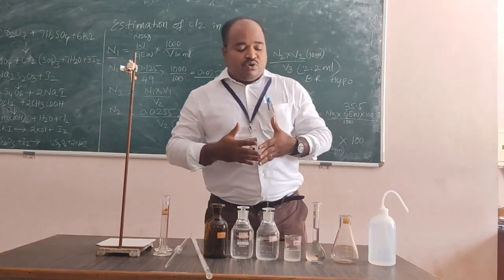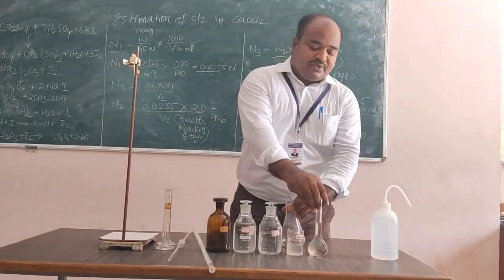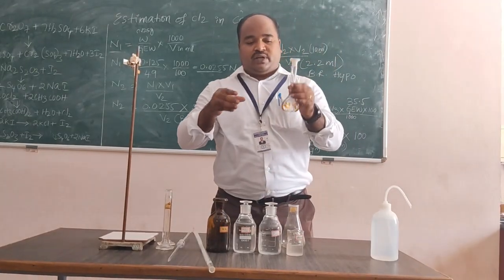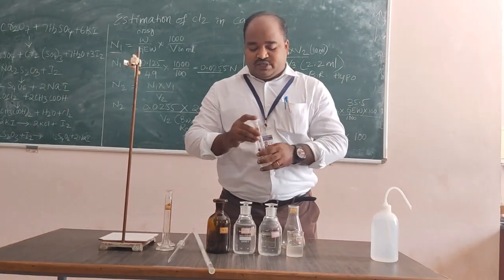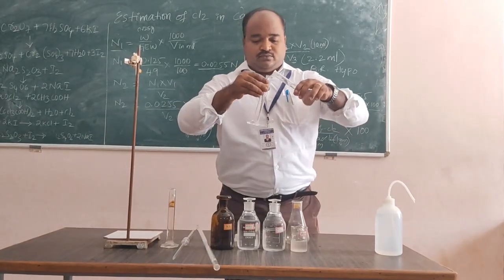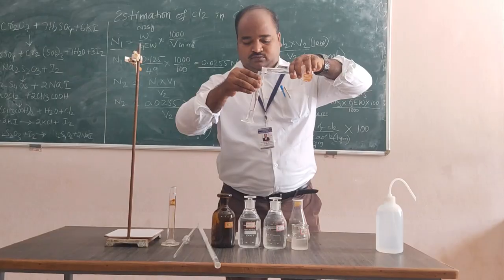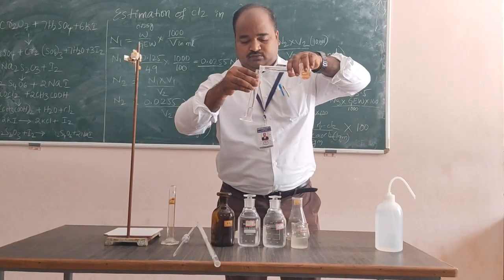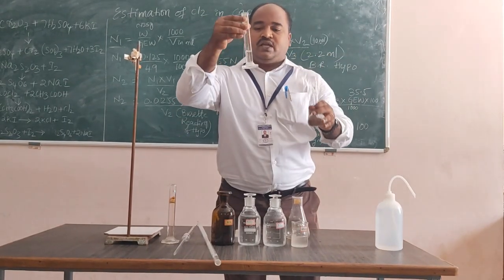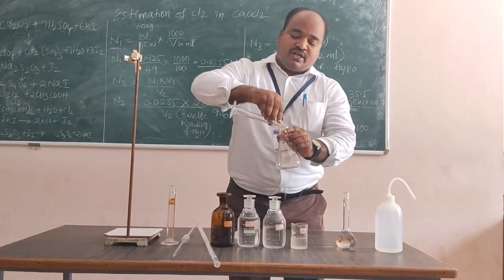Okay students, I am going to start this experiment. We need to take 10 ml of bleaching powder solution. I have taken 10 ml of bleaching powder solution and poured it into a conical flask.